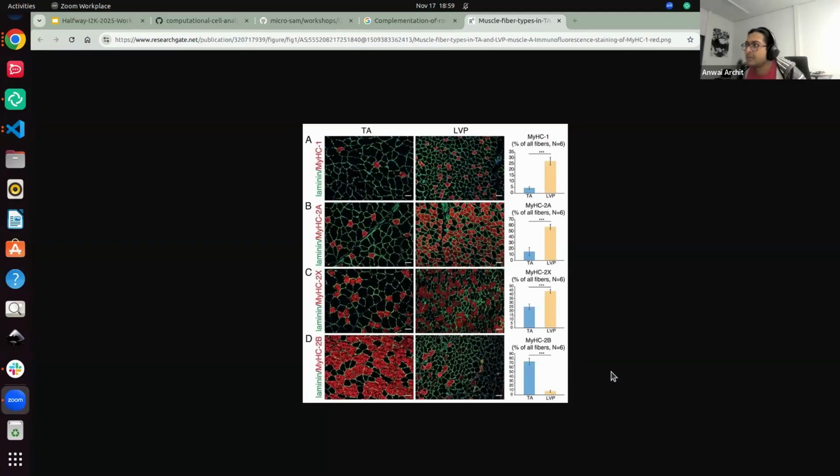If you remember, I teased an idea of the object classifier. This would be perfect for this. You use Microsam to do instance segmentation on these membrane-bound structures, which are cells in our case, and then use the object classifier to classify the cells on top, saying, I will say random things now, these cells have an uptake, these cells do not have an uptake, for example, of this particular compound.